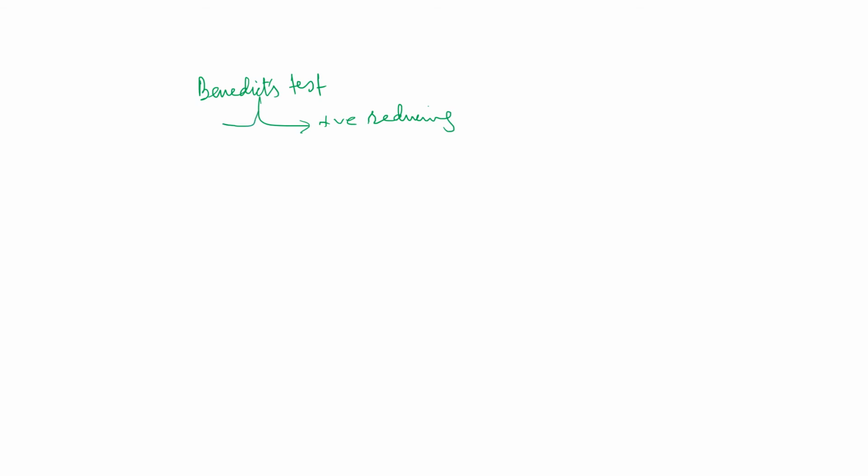And negative means reducing sugar is not present. That means it may contain non-reducing sugar.